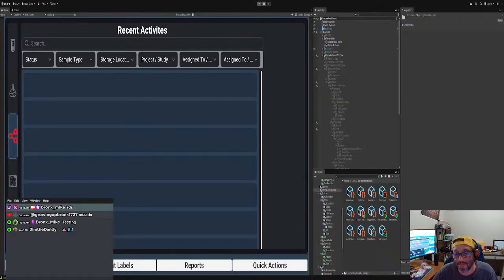Get results by order ID async. And the reason why you do that is because you might want to have a column or drop down that says ascending or descending, and then you just reference these methods, and they'll get you that. And then you could create your own tests, which this is not going to be part of. The sample scene just gets the test and displays the test.